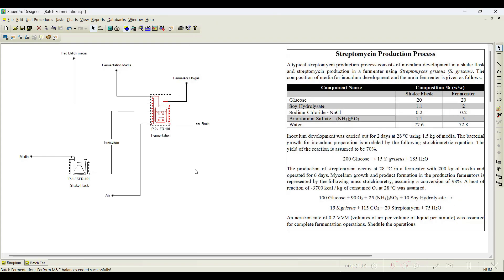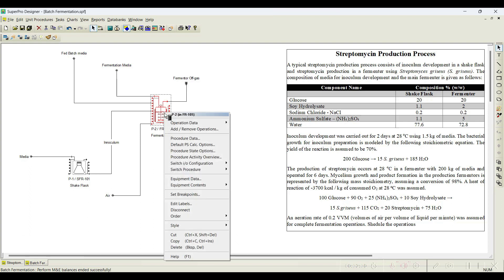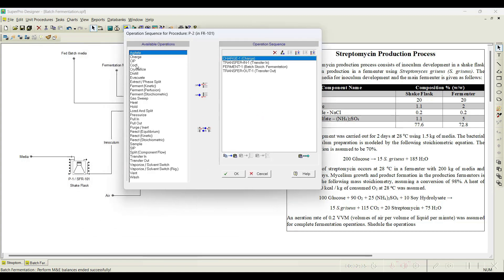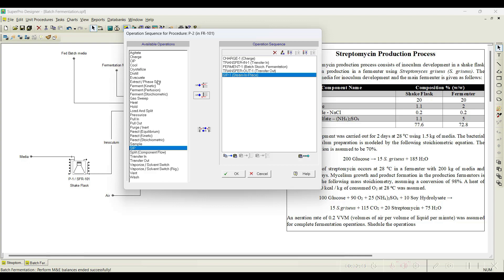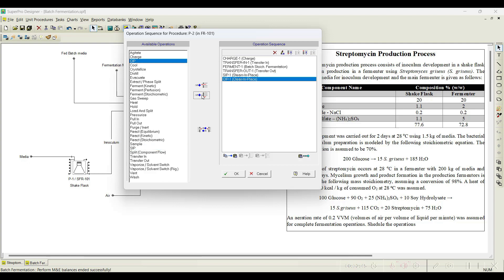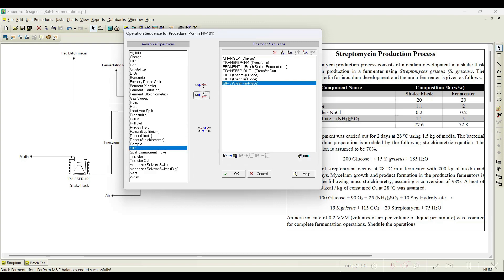This is how, if your process is fed-batch, you can add the streams and initiate it. Also, if you want to clean this particular process before the start of fermentation and also clean after the fermentation, you can add the cleaning operation. Go to 'add and remove operation' — for example, first I will sterilize it using steam, I will add this, and also once the sterilization is done I need to clean it, and post-fermentation I also need a sterilization operation.